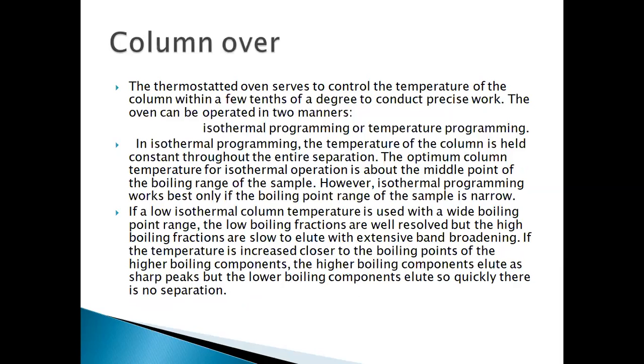Column oven is the third part of instrumentation. The thermostated oven serves to control the temperature of the column within a few tenths of a degree to conduct precise work. The oven can be operated in two manners: isothermal programming or temperature programming.